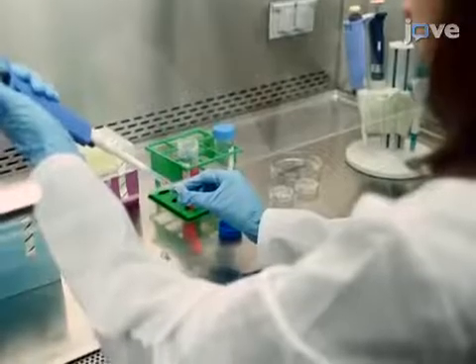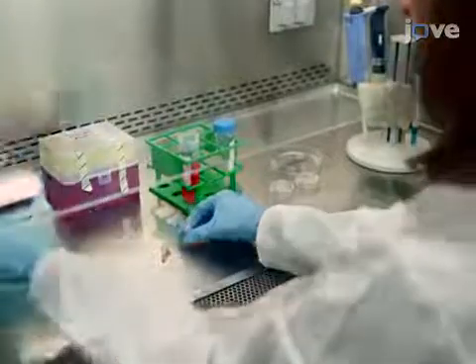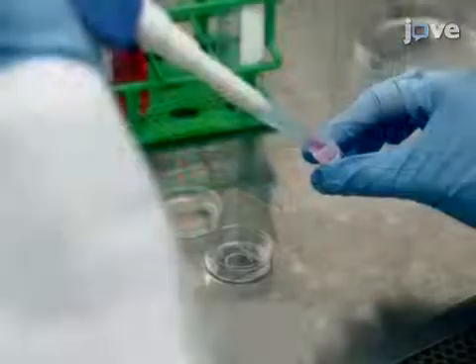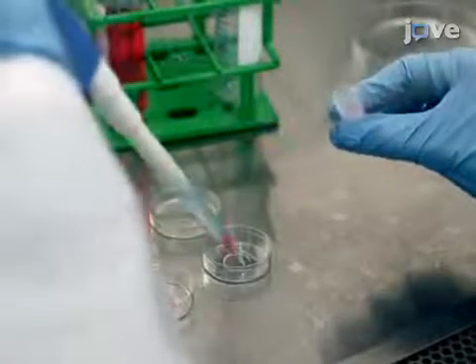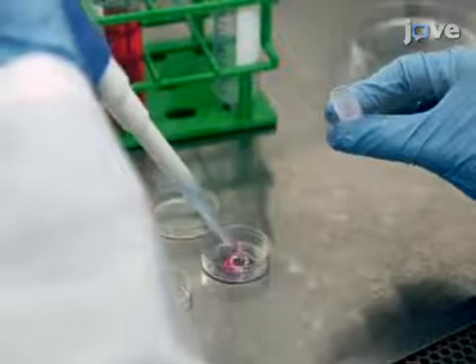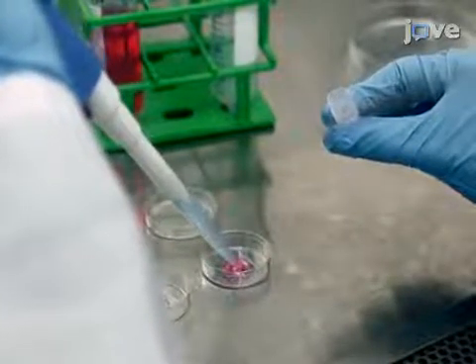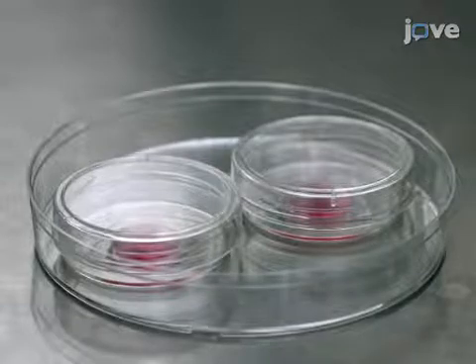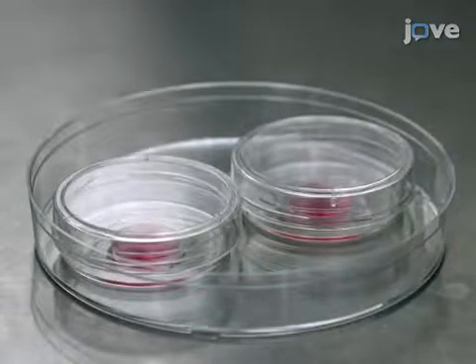To begin this procedure, prepare a 1 to 25 dilution of protein mixture in DMEM. Next, transfer 200 microliters of protein mixture DMEM to each 35 mm glass-bottomed plate to fully cover the bottom inner glass circle. Leave the plates at room temperature inside the safety cabinet for at least 30 minutes.